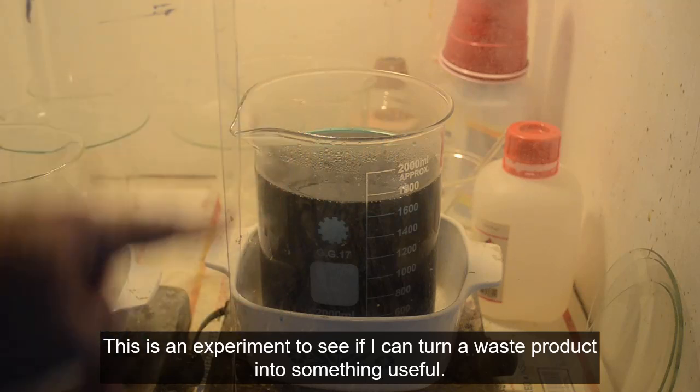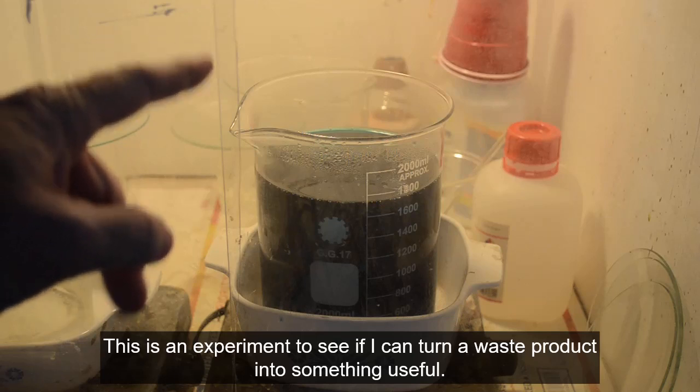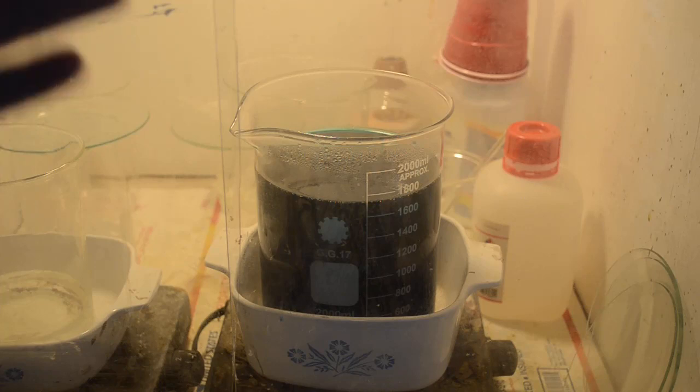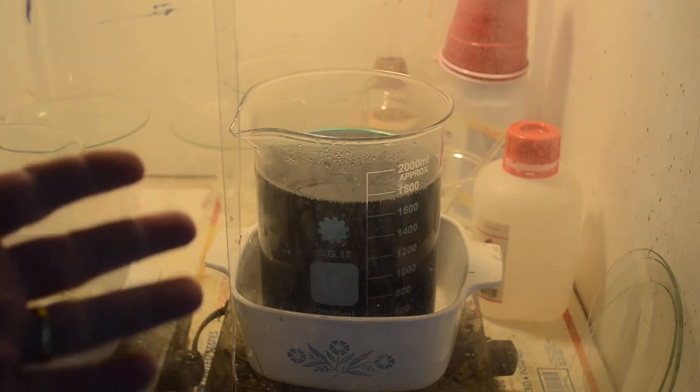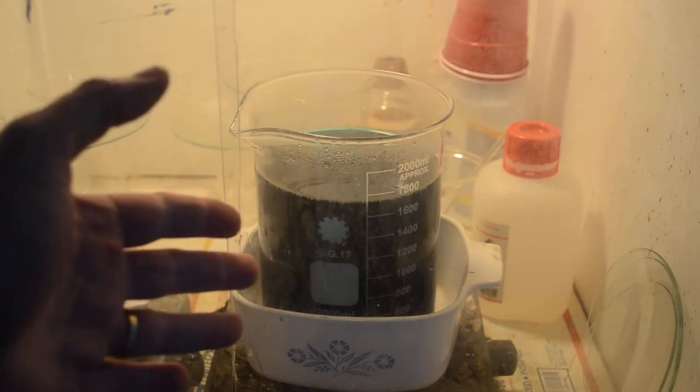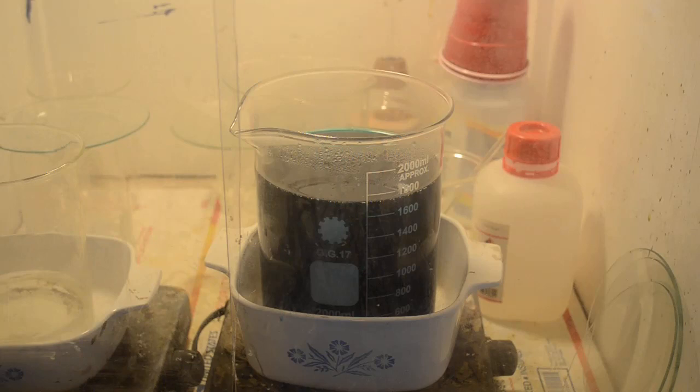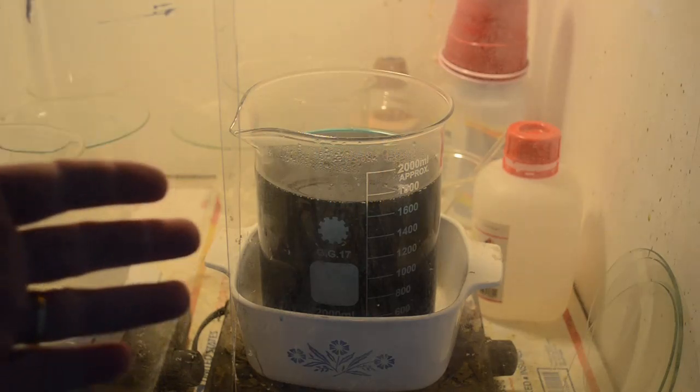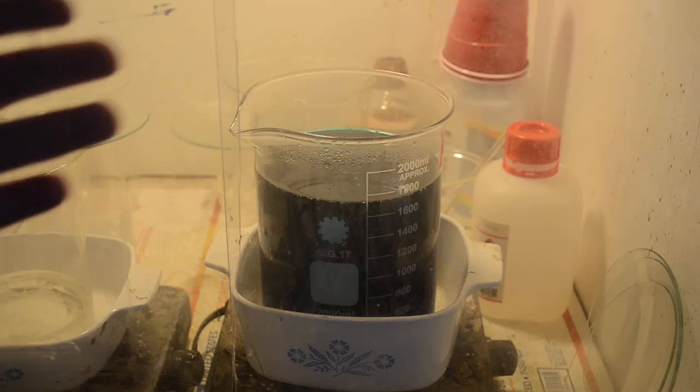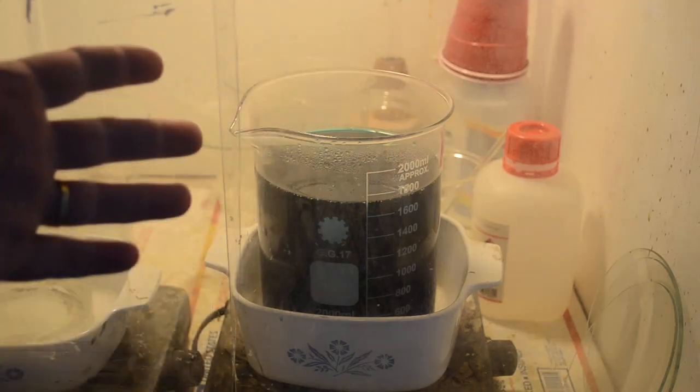I've got some spent solution here. This is the liquid I have used to extract the base metals from IC chip remains after I've incinerated them, pulverized them, sluiced them. I treat it with nitric acid to dissolve the base metals, and I have extracted silver from this, so there's no significant silver left in it. It's basically just a waste product at this point.